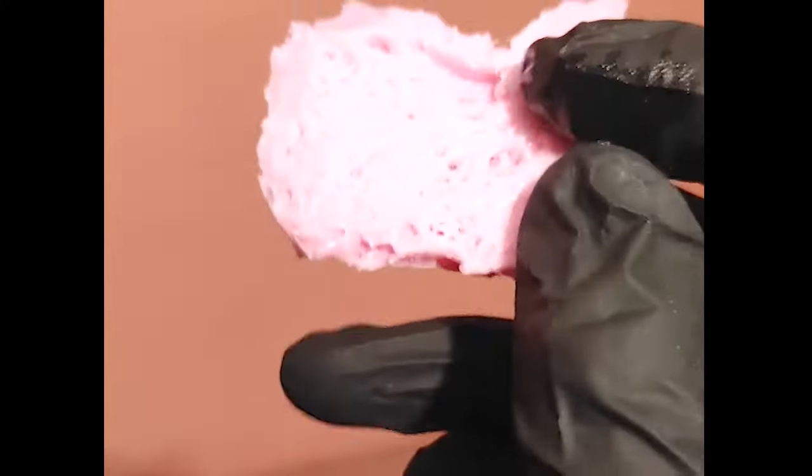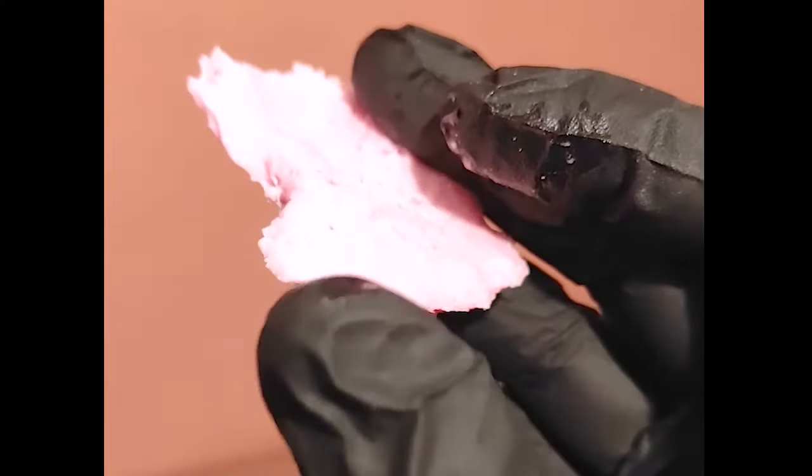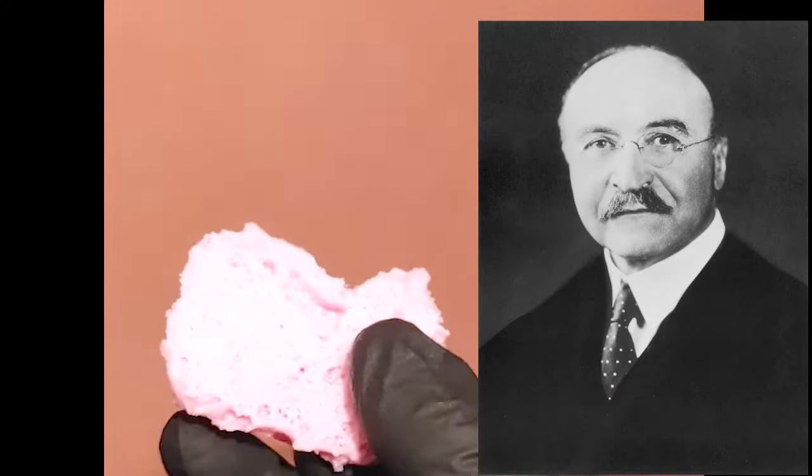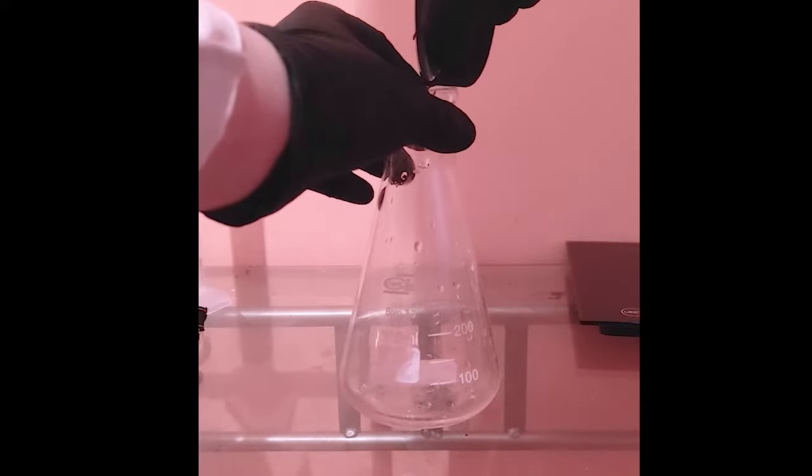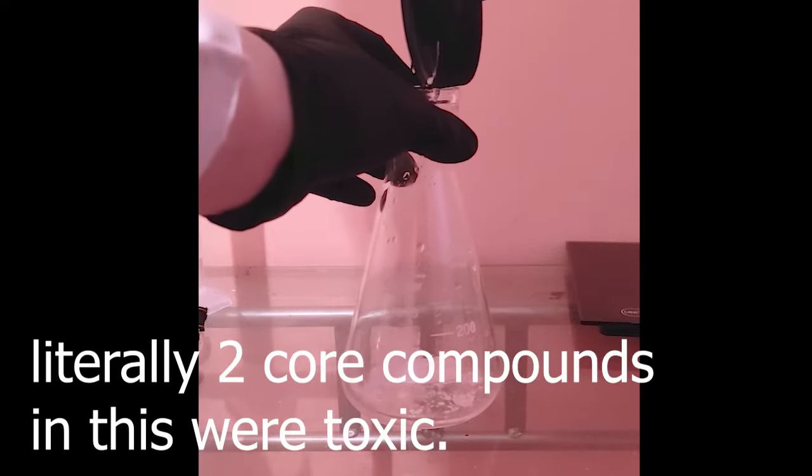Bakelite is probably one of the first plastics to ever be mass produced. The technology for production of Bakelite was founded by Leo Henry Baekeland, from which comes the plastic's name. In this video I am going to synthesize it, and wish me luck since it's my first organic synthesis — every time I've had to deal with anything organic I've had the feeling that I will die an hour later.